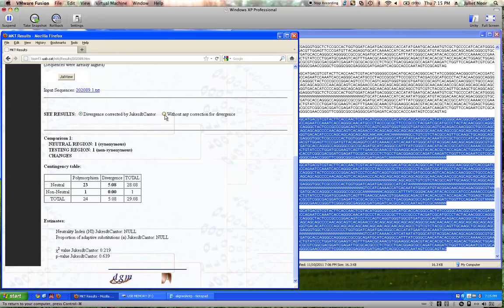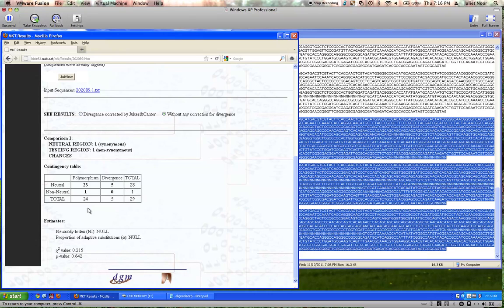These numbers look weird — they're not whole numbers, which doesn't make sense. That's because the divergence has been corrected, and we don't want to worry about that correction. Click the radio button next to 'Without any corrections for divergence' and you get nice whole numbers. Here in the contingency table — which is just what you saw in lecture — polymorphism is the same thing we discussed, and divergence equals fixed differences. This says 'neutral' and 'non-neutral' because you can assign different parameters, but we said synonymous changes are neutral, and non-synonymous changes are not neutral.